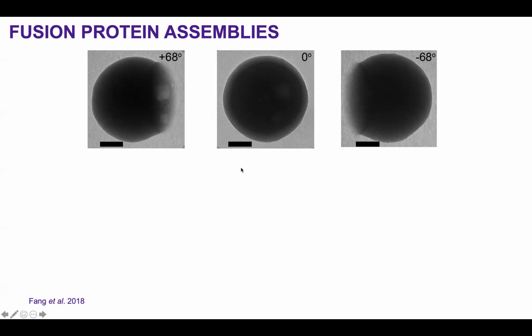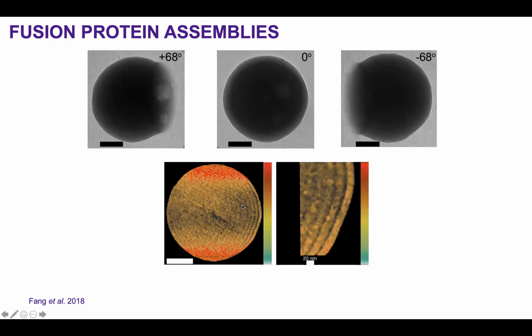But if you do electron tomography, you start to see some beautiful structures, and we can even see a few nanometer sizes. This is a protein assembly, and we can even see the small protein assemblies here, which form onion-like stripes. So sometimes tomograms can beat the formula. There's always a formula, but often they can beat the formula.